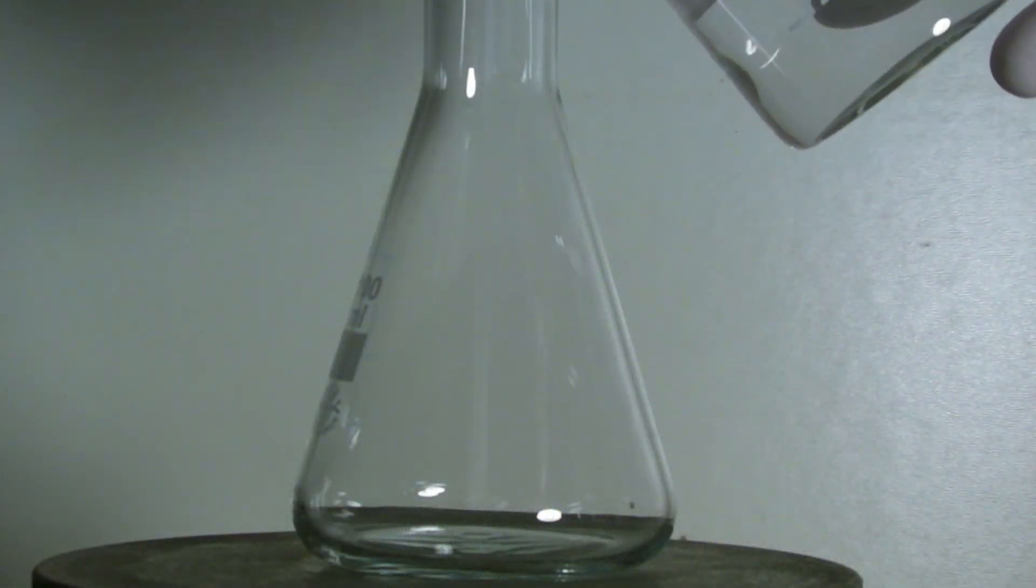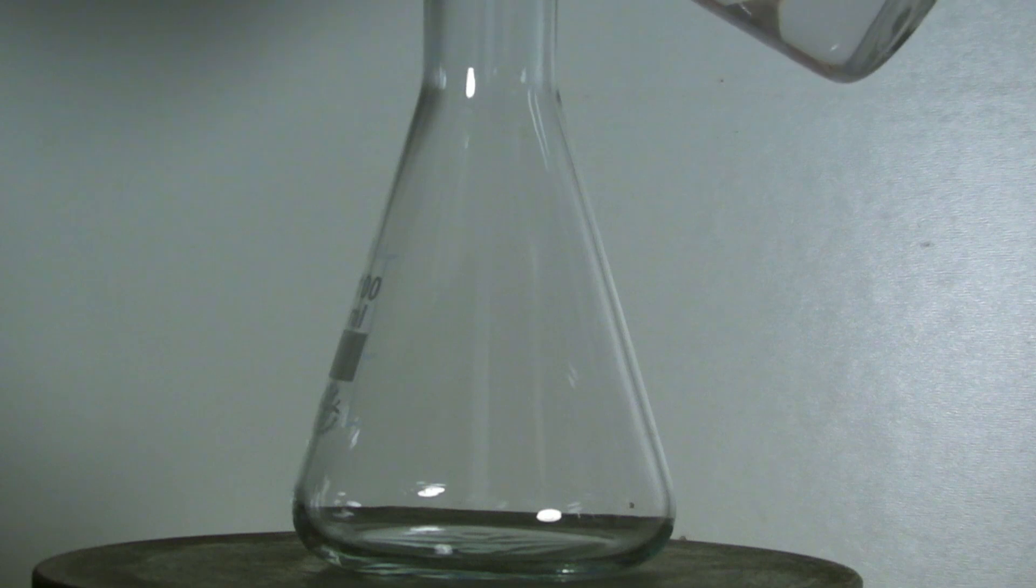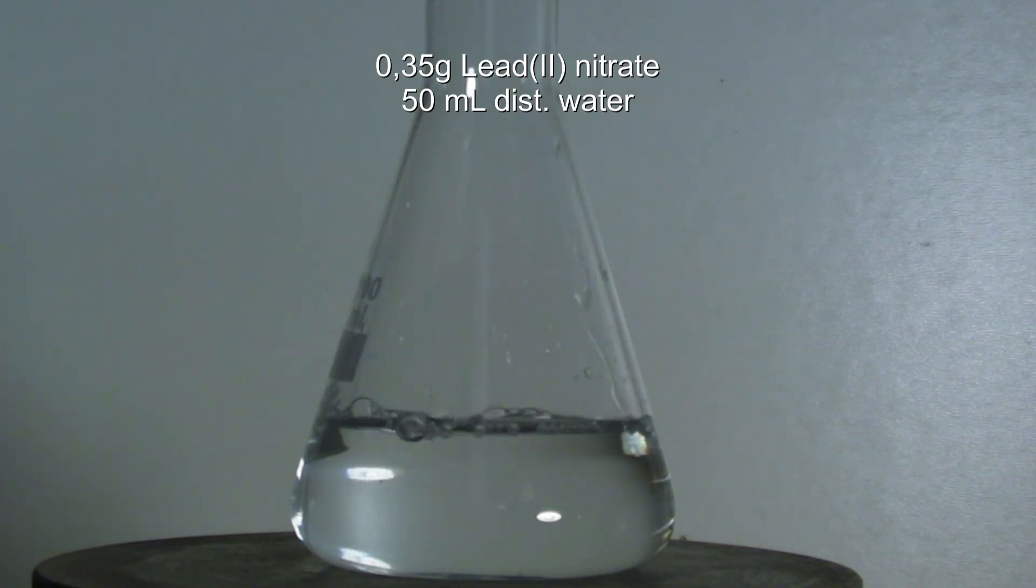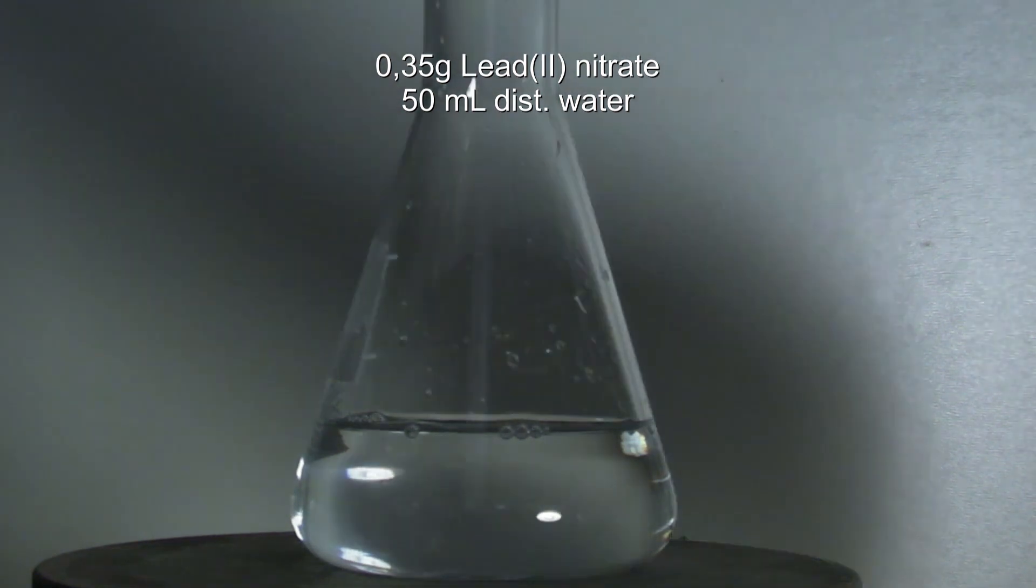To make the effect stronger, the experiment can be scaled up. For this, a solution made of 0.35 grams of lead(II) nitrate and 50 milliliters of distilled water is added to a 100 milliliter Erlenmeyer flask.